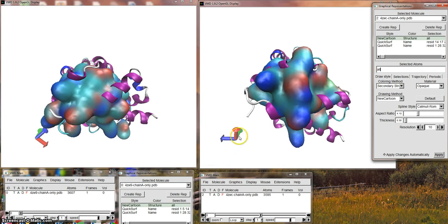This is oriented there and this is oriented here. This is the C terminal and this is the amino terminal. But notice the red, green, and blue axes. Blue is going that direction on this one and directly to the left on that one. So these are the same axes within the proteins, just reoriented so they look a bit similar. So it is a bit challenging to compare one thing to another.